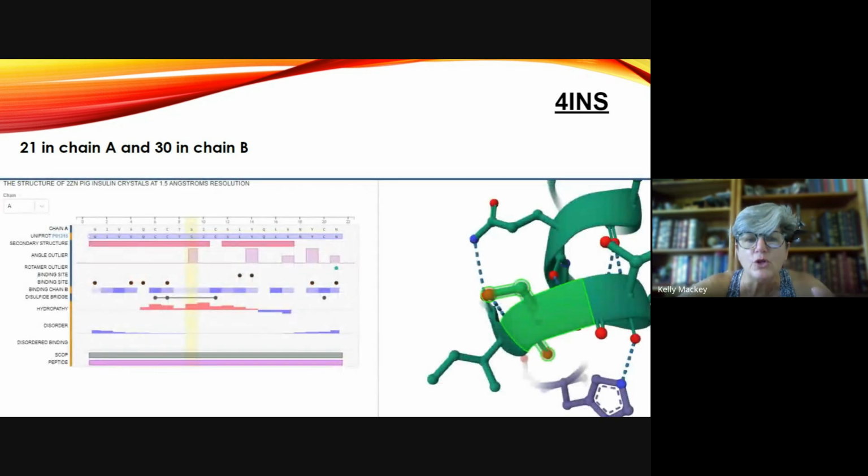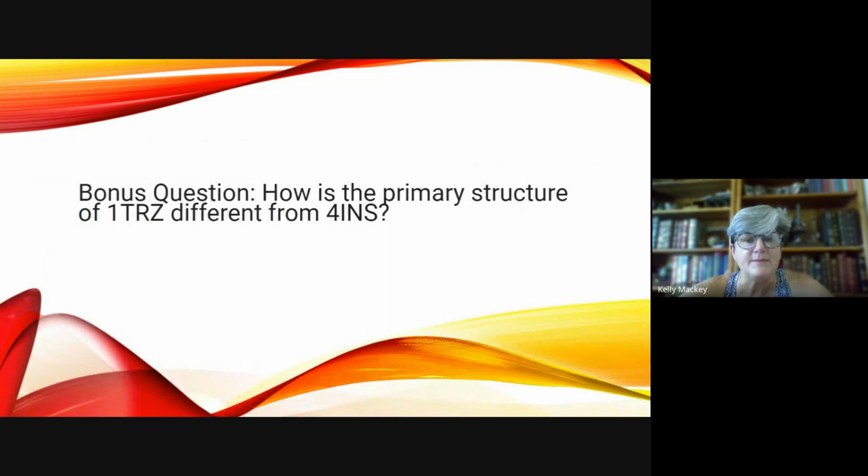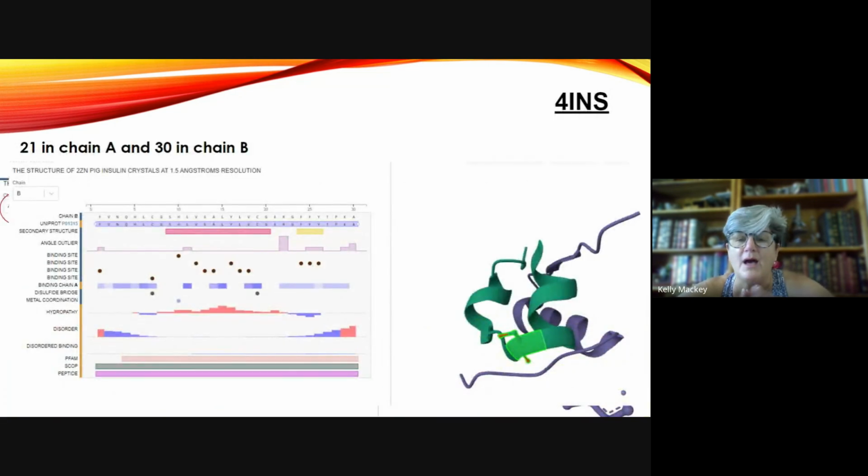When I look closer at chain A and chain B, that's all there is. Here's chain A with a total of 21, and I'm clicking on it, and I went through, as you click every single one of these. Here I've got one of them highlighted. It highlighted it in the model for me. I clicked all the way through it. Nope, there's only 21 there. And then I go to chain B and the same exact thing. So I'm not exactly sure. I think it's a dimer.